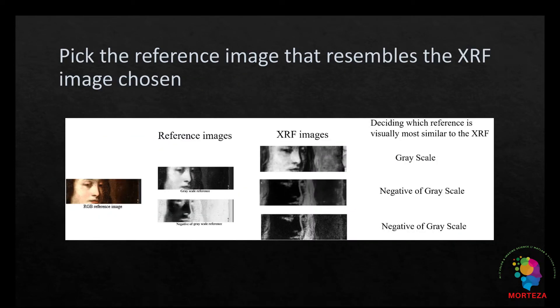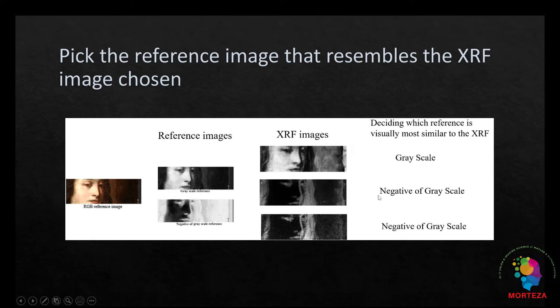The second stage is that now we have two different reference images: one is the grayscale reference and the other is the negative of the grayscale reference. The experimenter should first choose the reference and the XRF image that are most similar to each other visually. It does not matter which XRF image is chosen for this process — what matters is to choose the reference and the XRF that are visually most similar. For example, this XRF is more similar to the grayscale reference, but these two are more similar to the negative of grayscale reference.